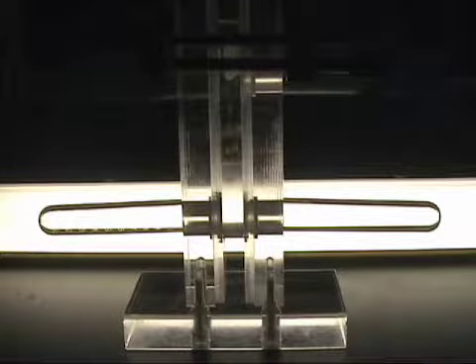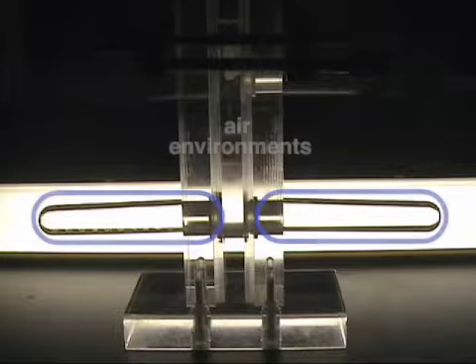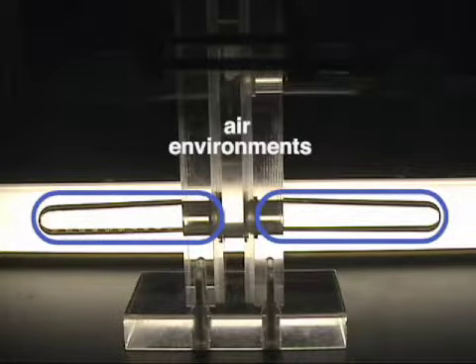In this experiment, Drosophila, or fruit flies, are placed in a T-maze and presented with a choice of air environments to test their sensitivity to specific odorants.